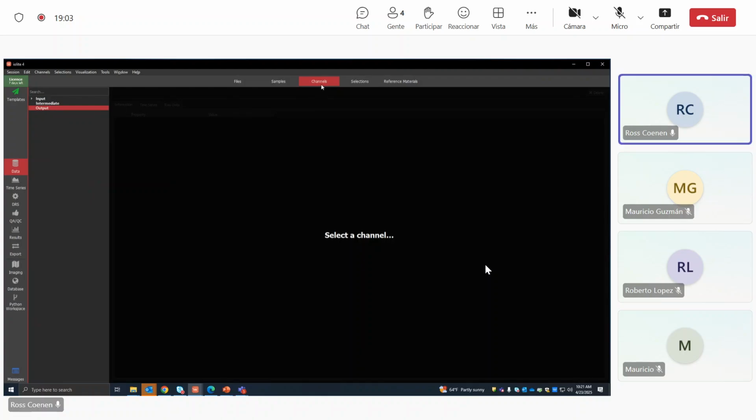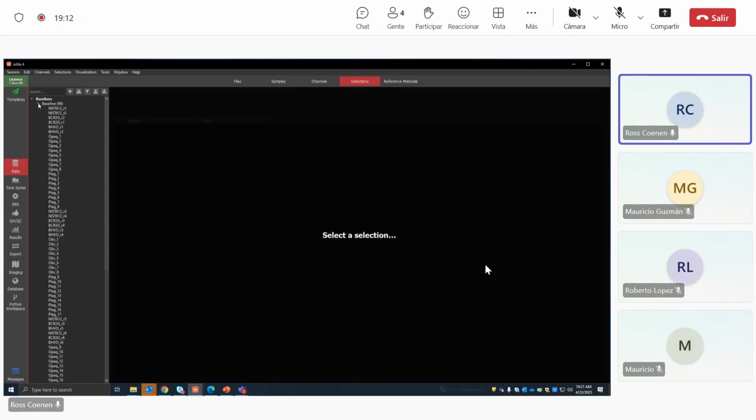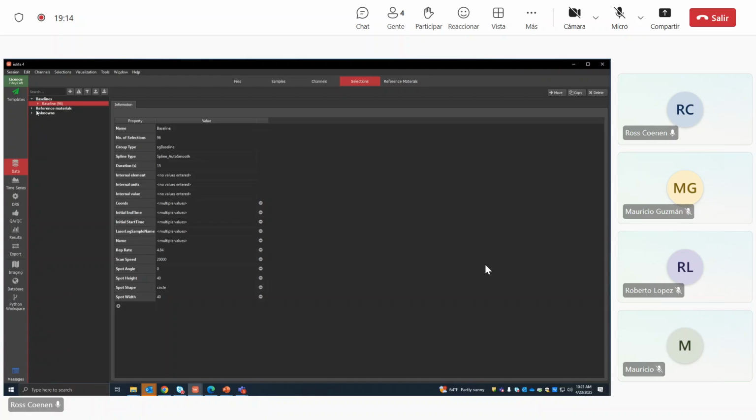If we want to view the selections that we made, just what we did a little bit ago, we made selections for baselines. We have 96 of them. We made reference material. We have 3 of them, the BCR, BHVO, and NIST 612. And we have unknowns, the OPAC, PLAG, and the olivine.